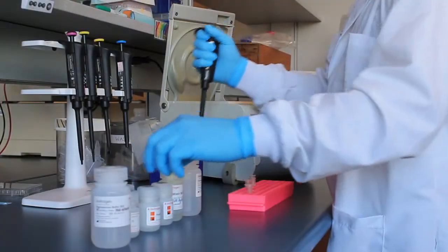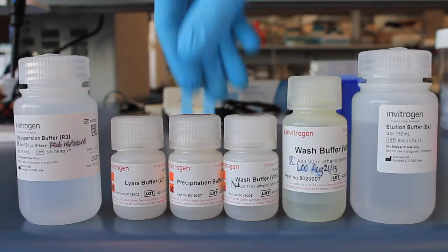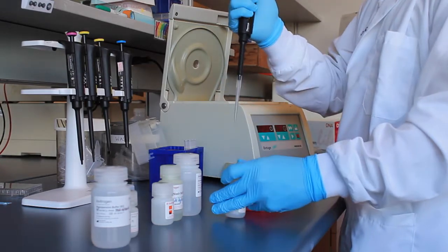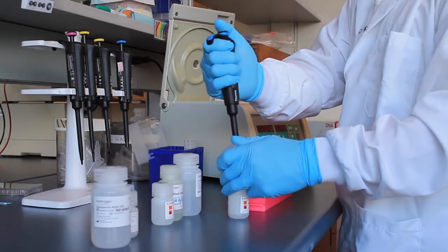After letting the solution incubate for 5 minutes, add precipitation buffer and mix immediately by flicking the tube or inverting it up and down. Do not vortex at this step.